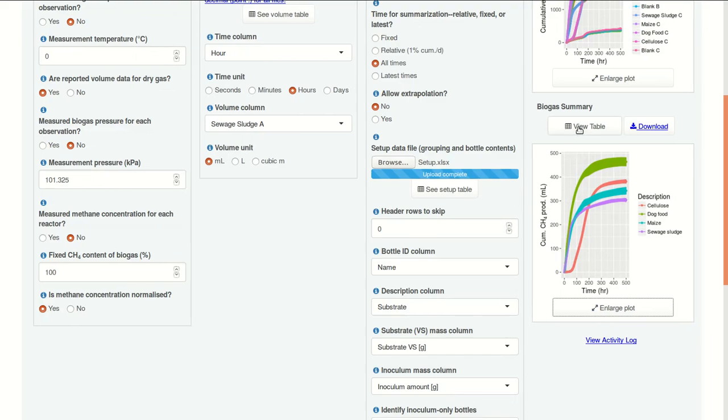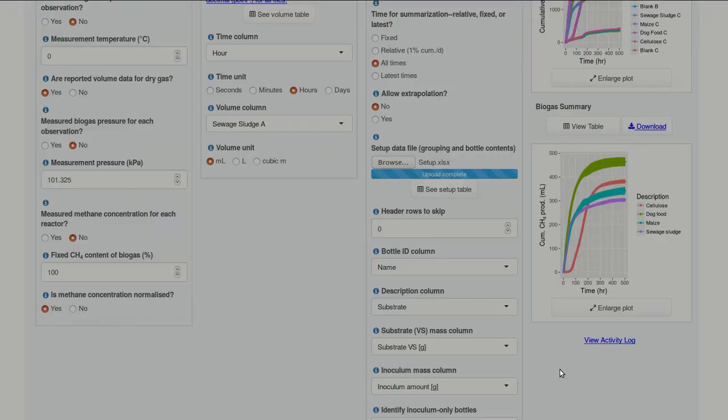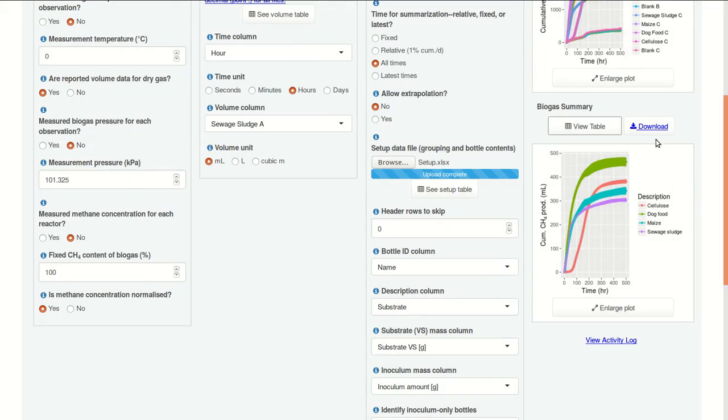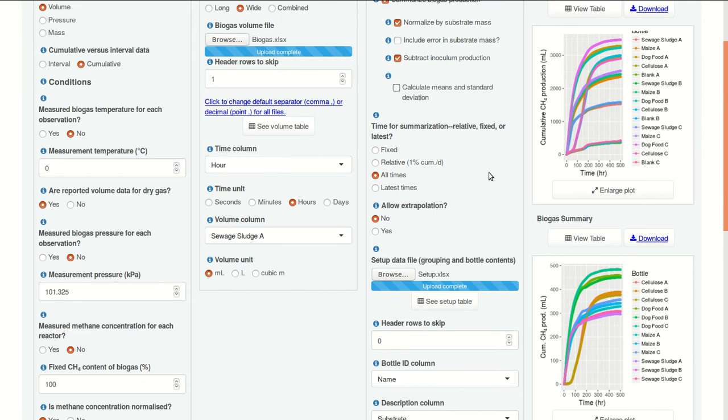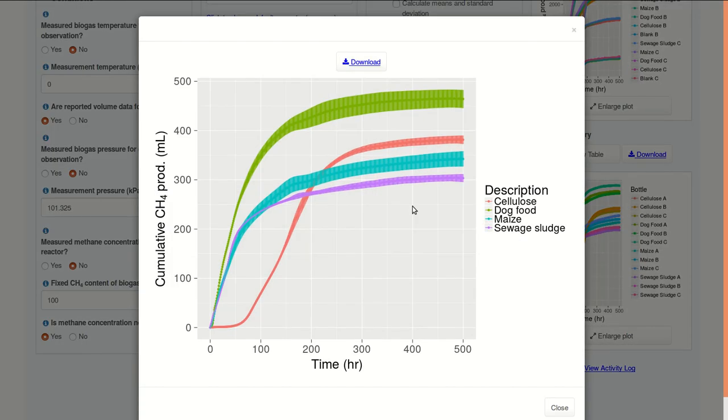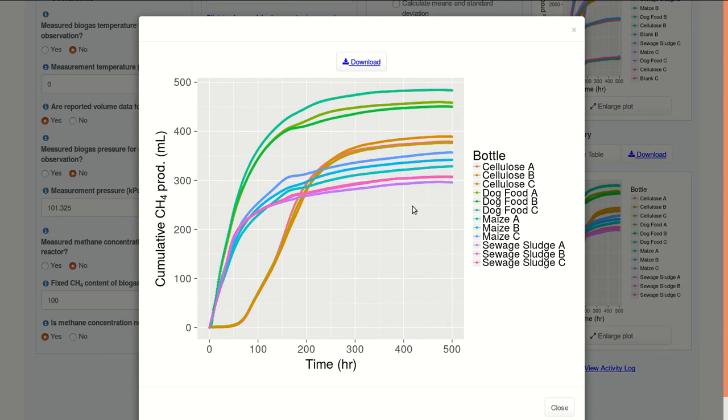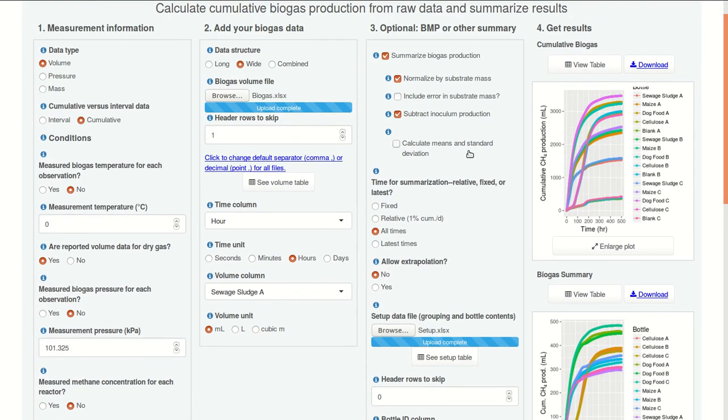These data could look at them as well. For each hour, each substrate, we have a mean and a standard deviation. And, of course, they can be downloaded as a CSV file. We can turn off this option. And now we have normalized methane production for each bottle. Earlier we were looking at means and standard deviations. And here we have values for each individual bottle. Those are the different options that can be used in OBA to summarize biogas production and express BMP using a few different methods.